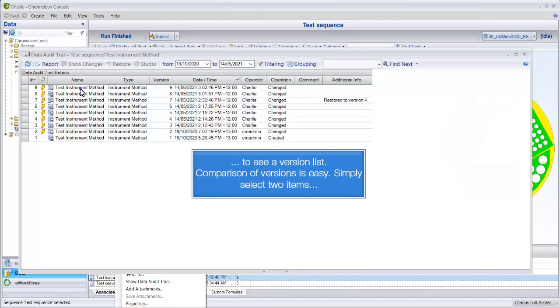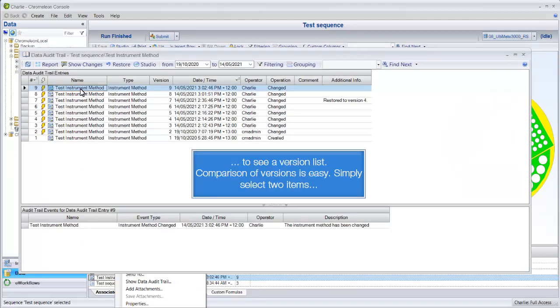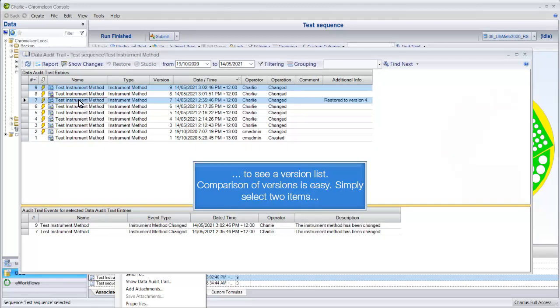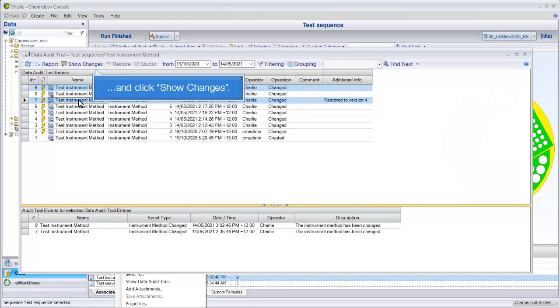Comparison of versions is easy. Simply select two items and click Show Changes.